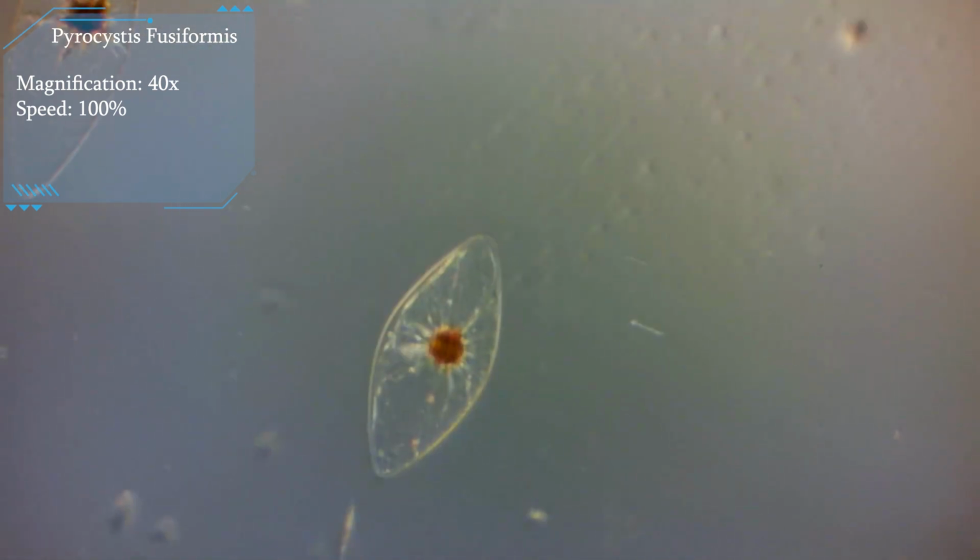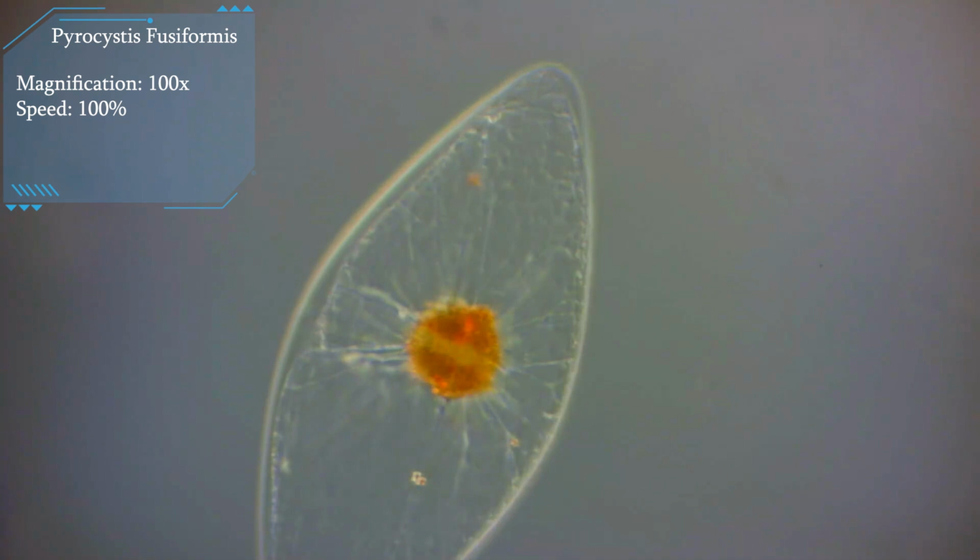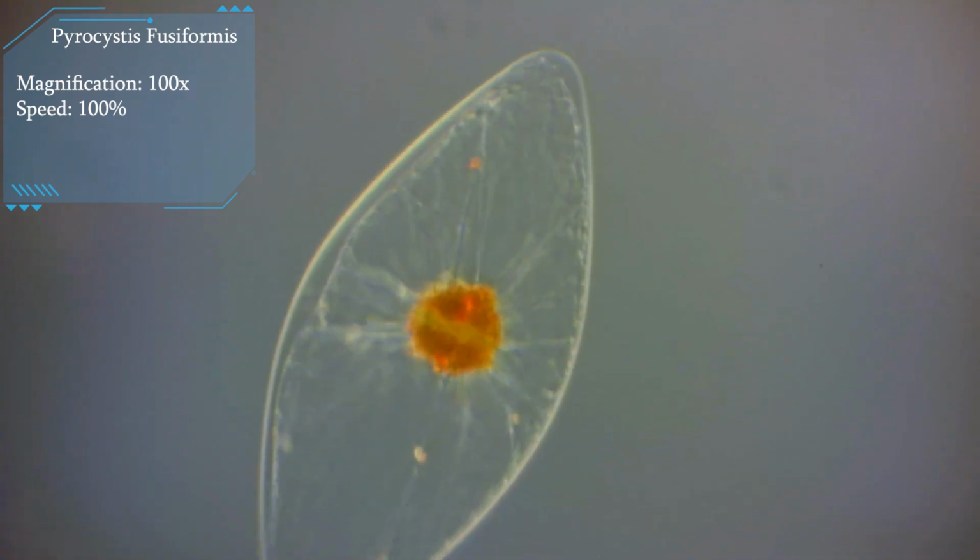I was thinking about a method where I would not use the cover slide and would use some tools to touch them directly, but this is not something I was thinking about while I was observing this. And this is everything I can show you now.